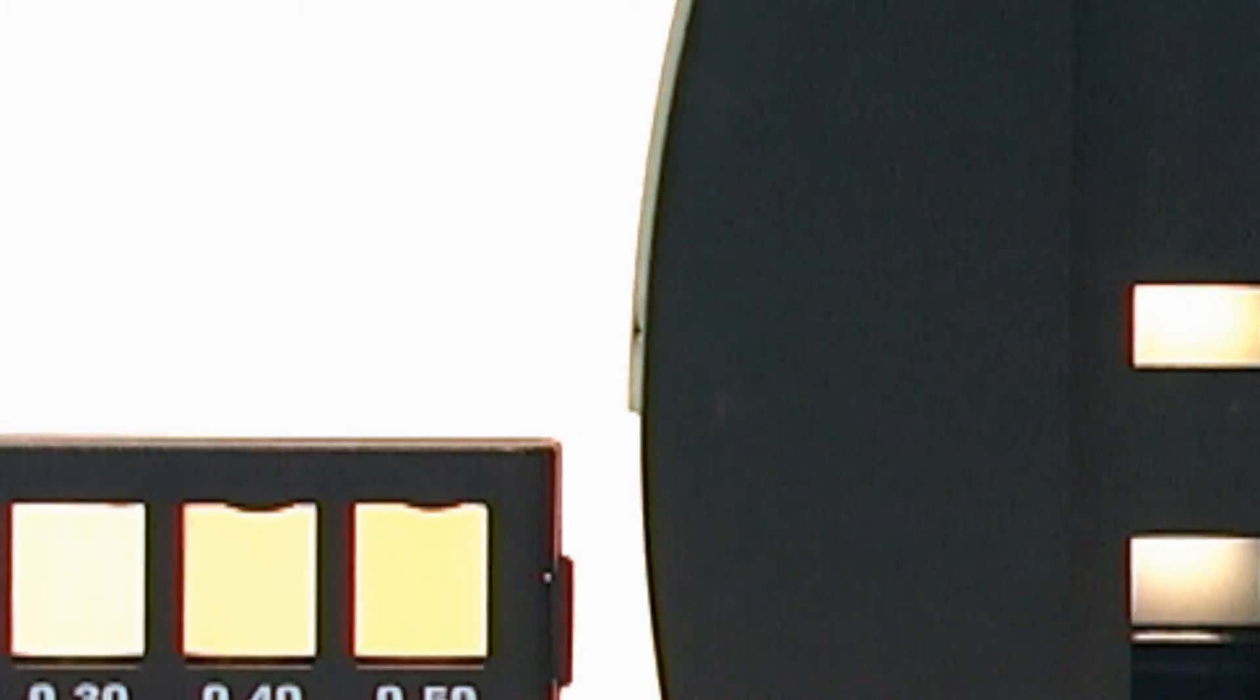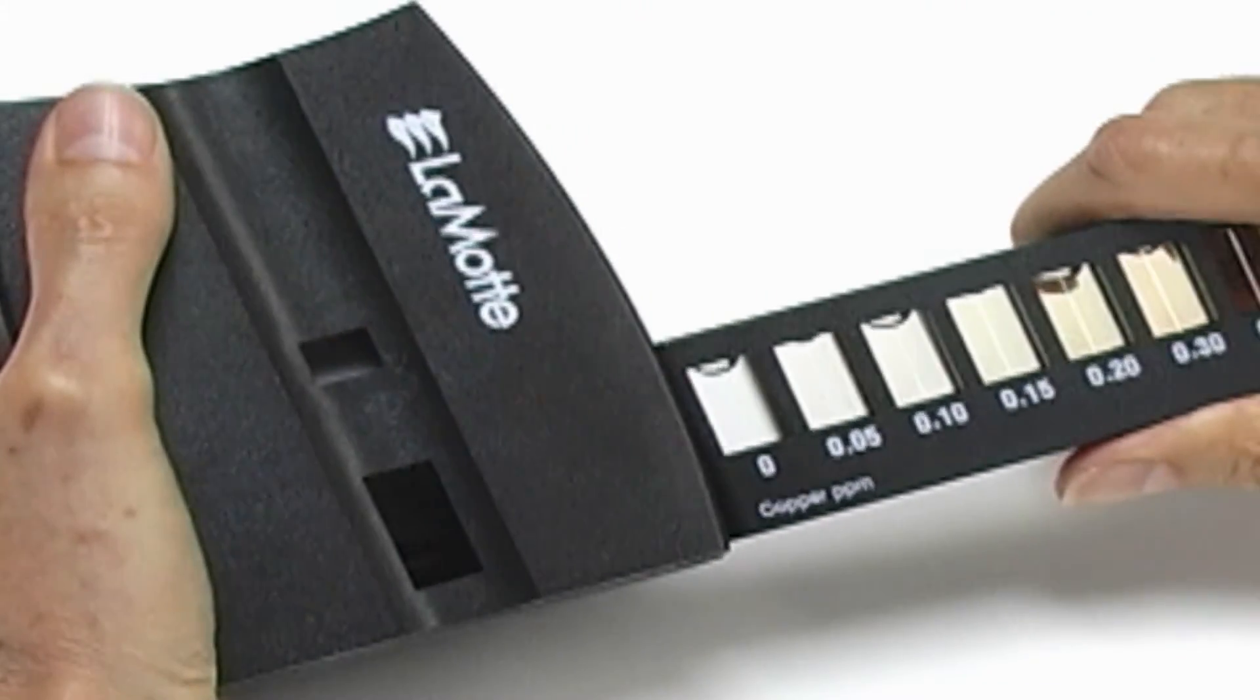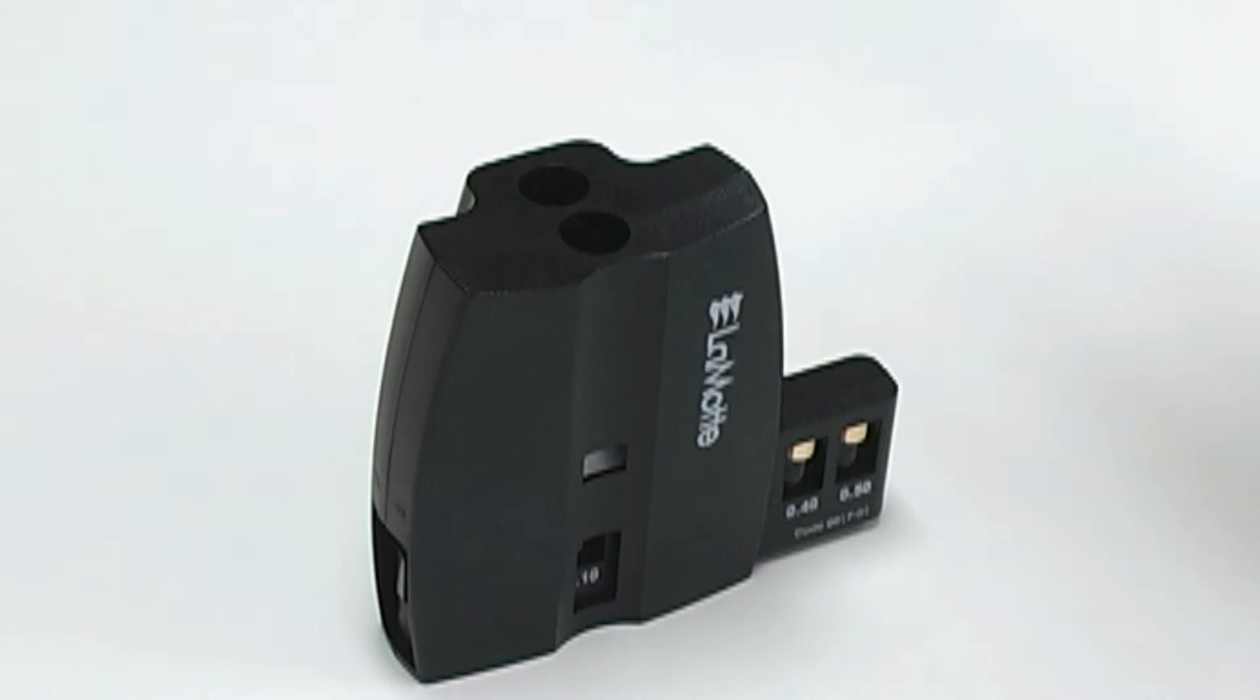Here's how to do it: slide the low range comparator bar for your test into the bottom of the comparator viewer. Fill a test tube to the 10 ml line with the untreated sample water and insert it into the rear hole of the viewer.